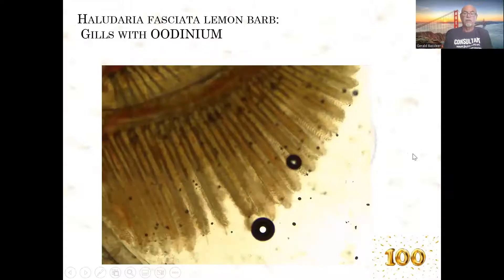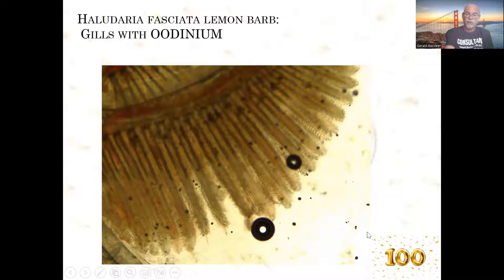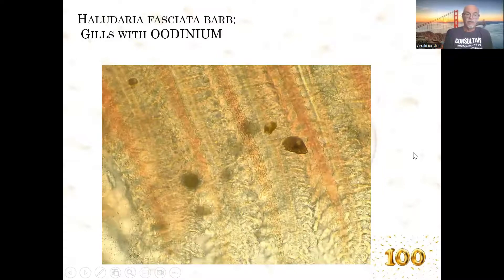You can see here the mix of infections, and when we examine the gills we see all the black spots in here — those are all oodinium. You can see here already some damage which occurred to the gill tissue, which is of course devastating for a fish. Here you see some air bubbles — no disease, no parasite, that's a typical air bubble. The black spots are oodinium, non-moving attached parasites. Some fell off onto my slide, and at larger magnification you see the oodinium attached in between the lamellae and in the gill tissue.